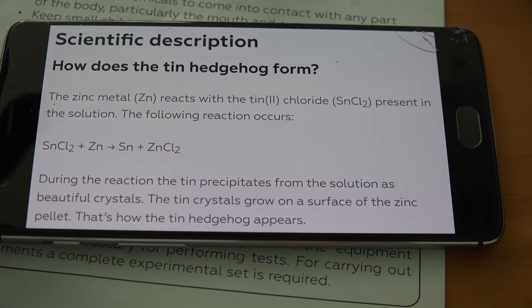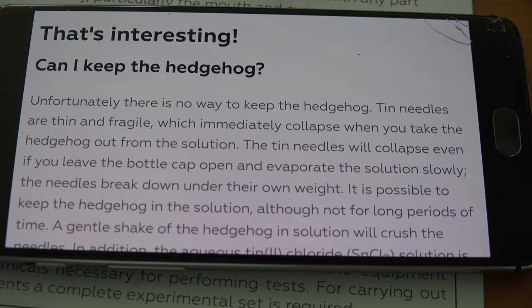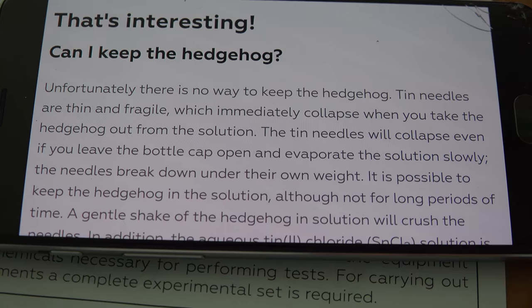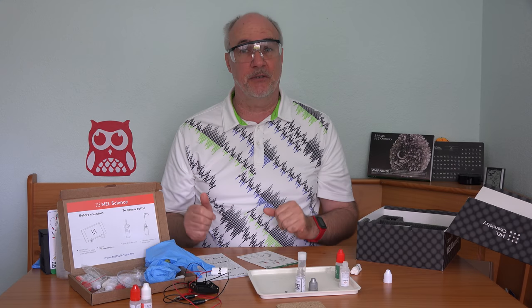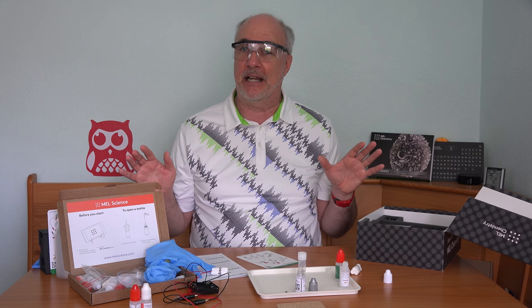I was a little disappointed with how this experiment was looking after the first few minutes — I really thought it was just going to be cloudy water with something I could barely see. But using the macro lens to get a close-up view of all the little needles of tin forming on the zinc pellet actually is pretty cool. You can go to the app to learn more about exactly what was happening. And what everyone wants to know — can I keep it? Well, you can keep it, but all the needles will break off; it's just too fragile to exist outside of the solution.